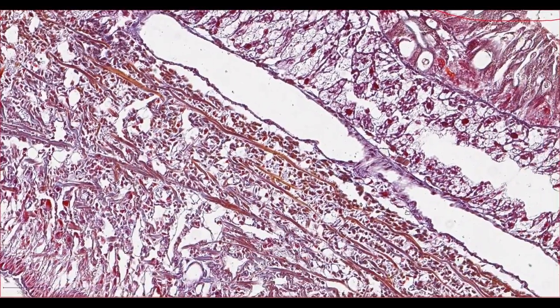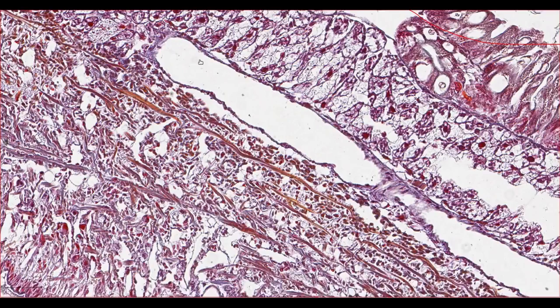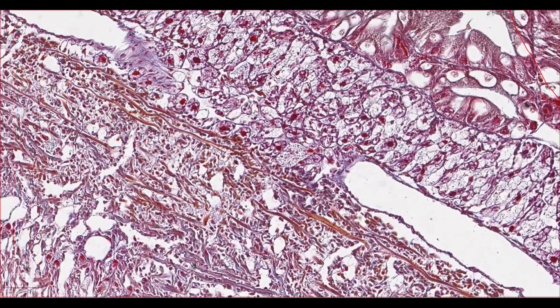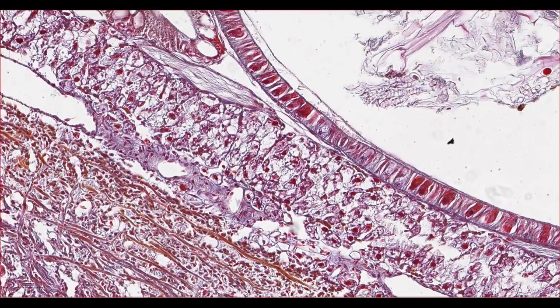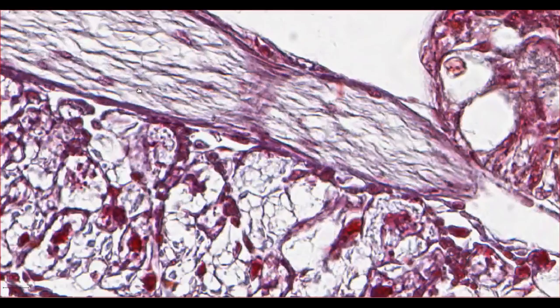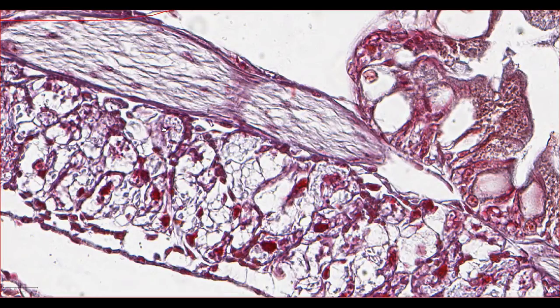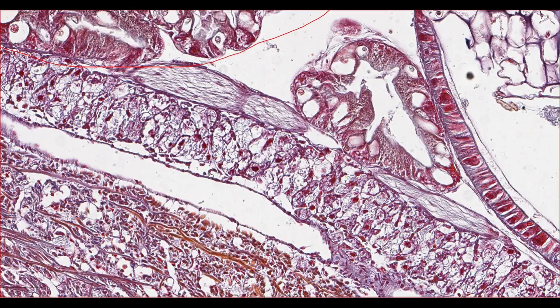We can also make out this large blood vessel here between the muscle and the secretory gland, which also flows along the snail's ventrum. And in some sections, we start to get what looks like a nerve fibre here. This makes me think that this is a very median section from the snail, meaning that it's taken straight down the middle.